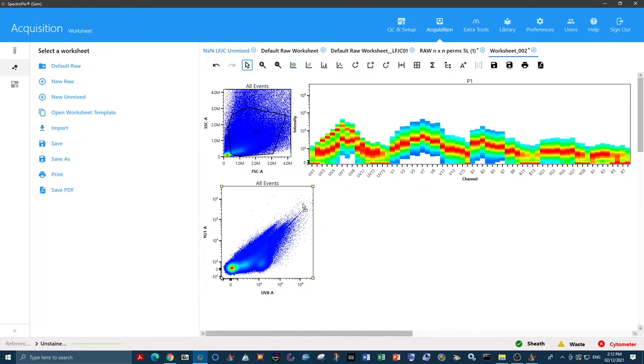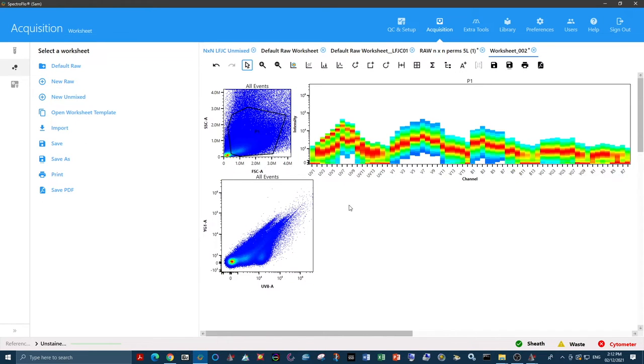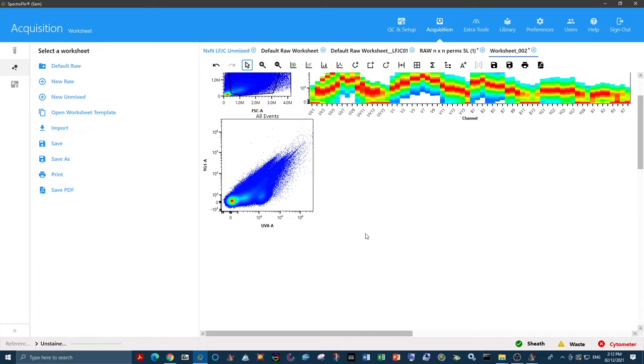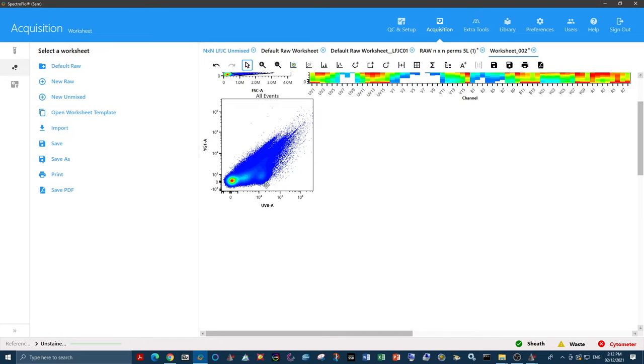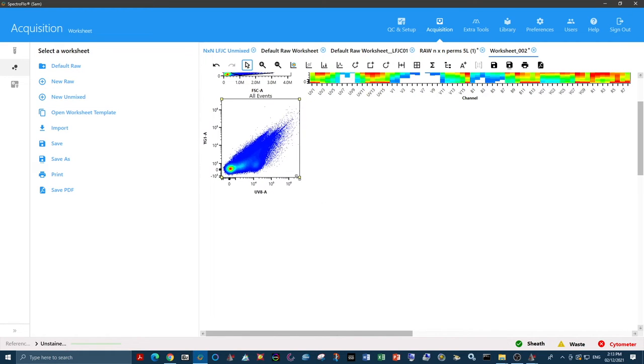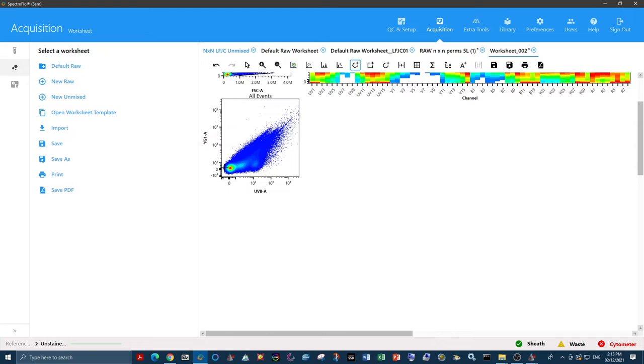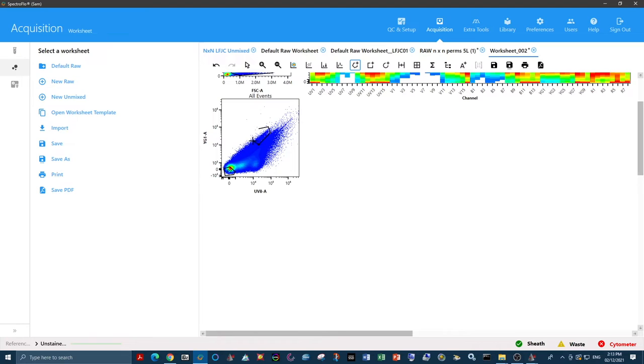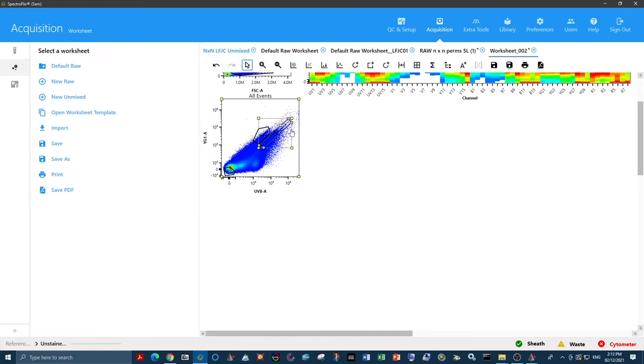Now we're moving into the distinguish section of the protocol. We're going to distinguish what these spectral signatures look like, and whether they are actually different at all. We're going to put gates around these different populations, starting with my dim autofluorescence, then my YG1 high population, the high in both population, and the YG1 low population.